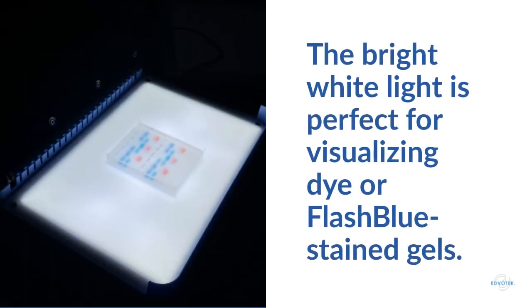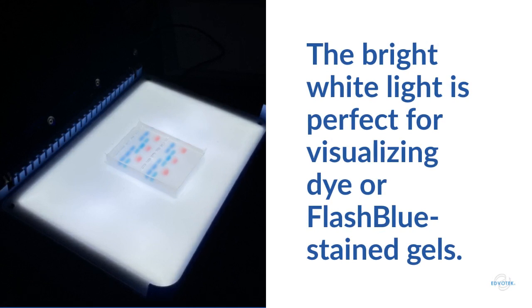The white light functionality is ideal for viewing agarose gels stained with Flash Blue DNA stain, protein gels stained with Flash Blue protein stain, or dye samples run in agarose gels.